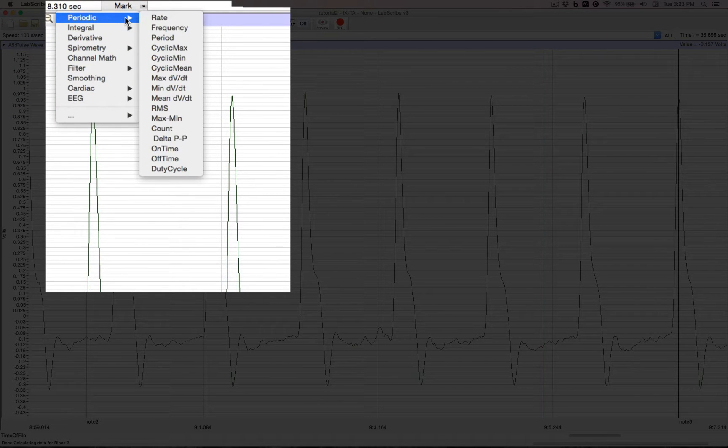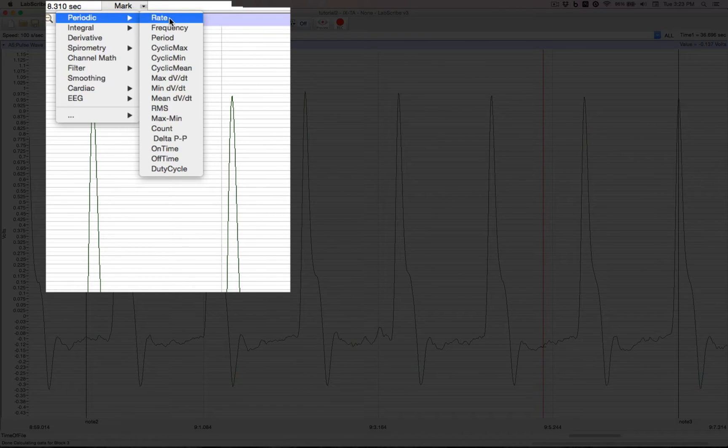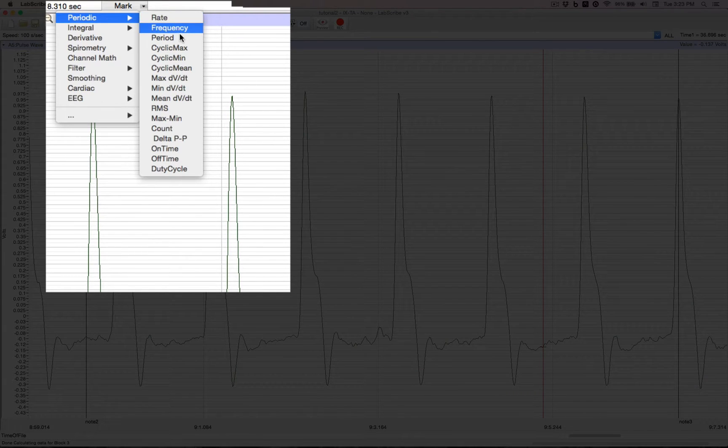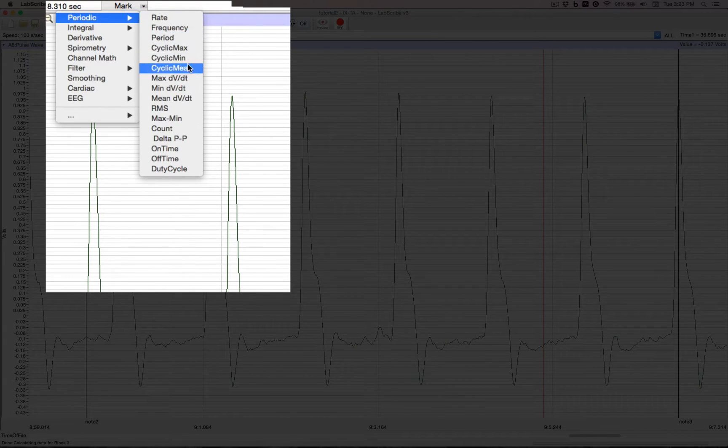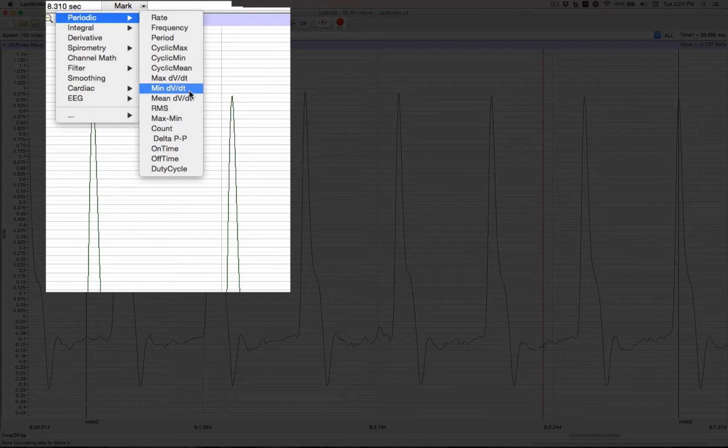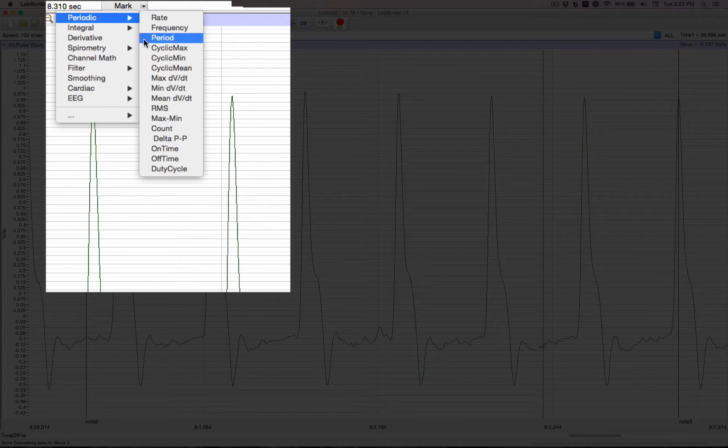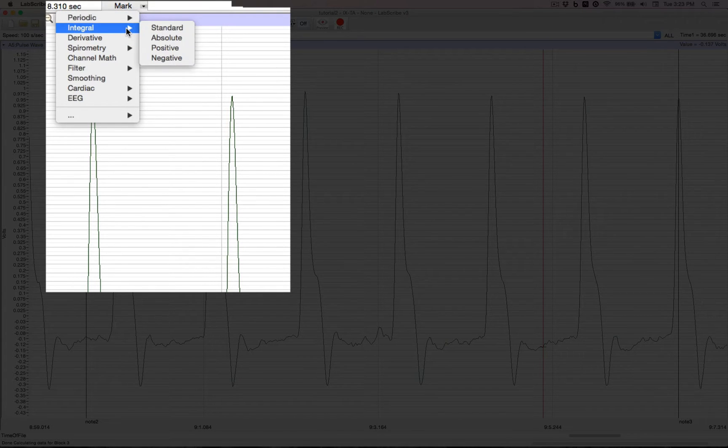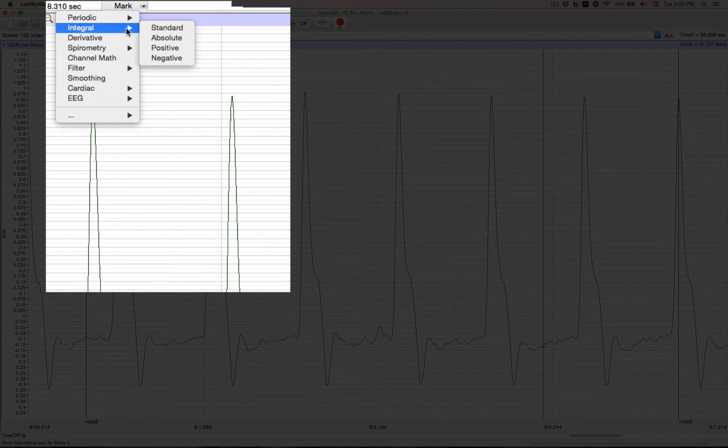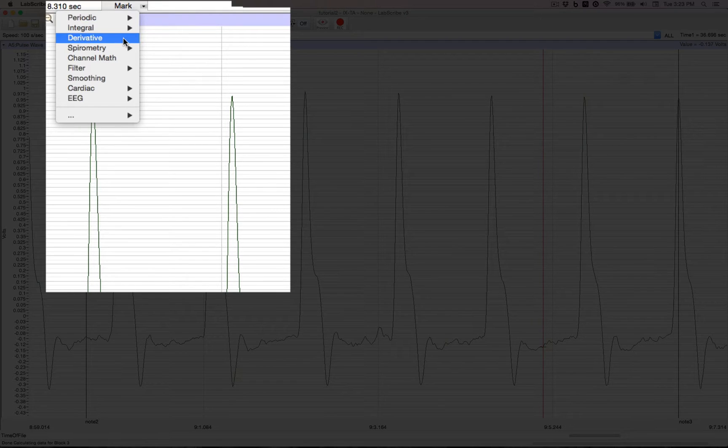We have periodic functions like rates, frequencies, periods, cyclic means, maxims, slopes. Integral functions for area under the curve. Derivative for slope.